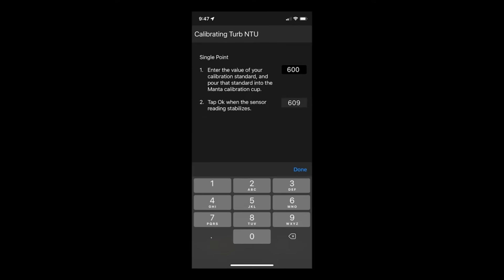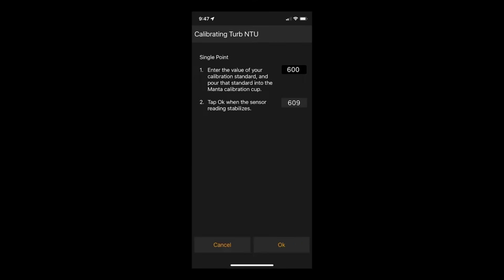The following screen will prompt you to enter the value of your calibration standard and pour that standard into the calibration cup. Just wait for that reading to stabilize and tap OK at the bottom of your screen.